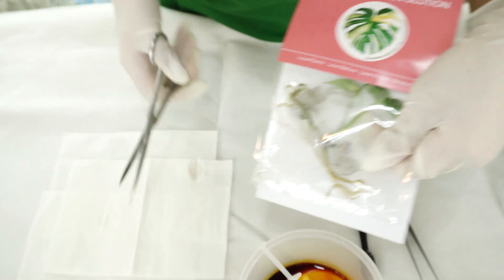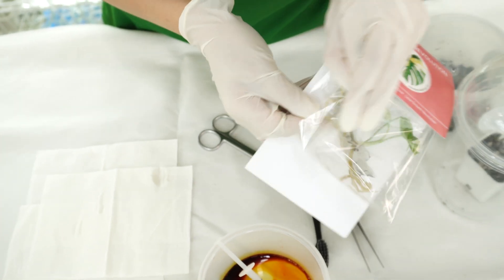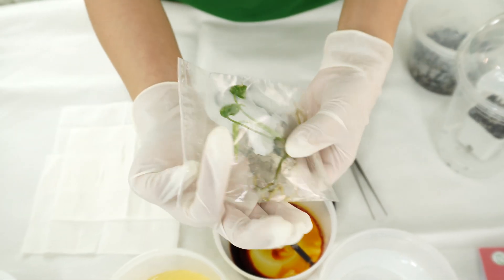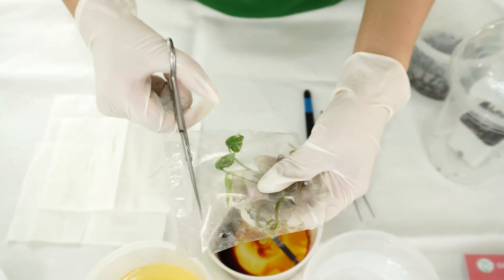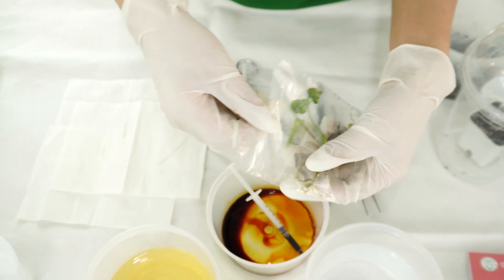We're going to cut the side of the package. Inside this packet there will be another plastic container. Just cut it open, take it out, then cut the top part of the container and take the plant out.